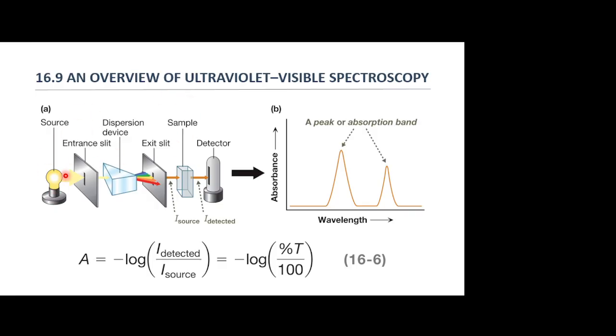So oftentimes the same instrument can do both, because in reality visible light is not actually its own thing. Visible light is actually a subset of ultraviolet, really, for the most part. And so most instruments can do both parts, but many of them do not, to save cost, because the bulb.